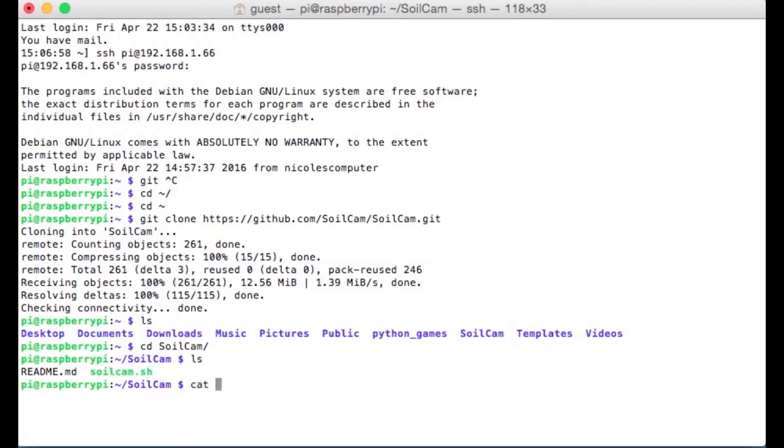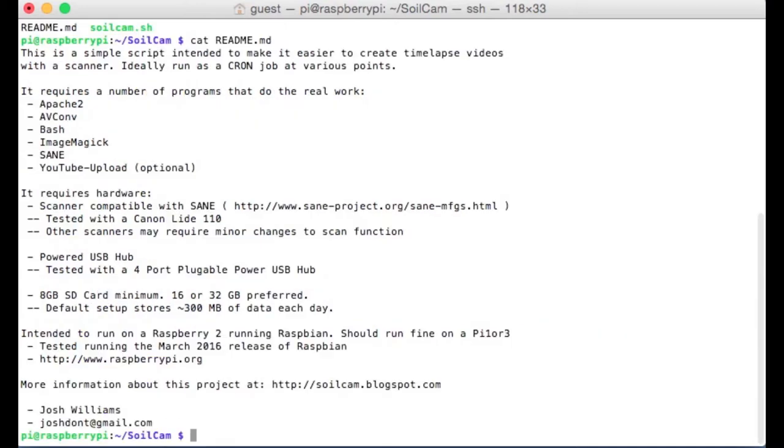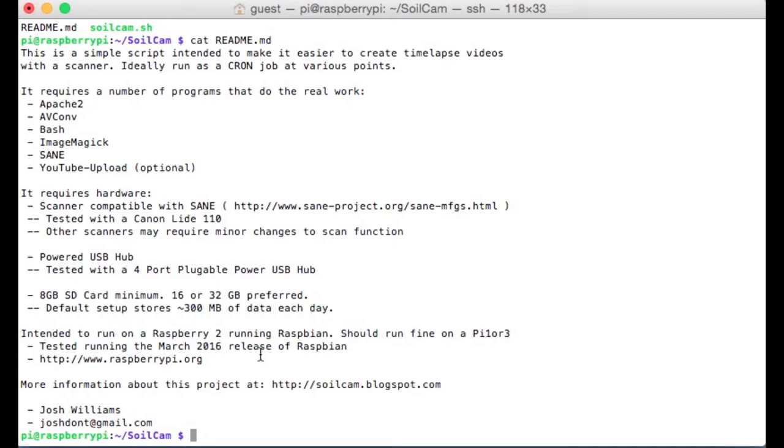If I use the program cat, I can type cat readme dot md, and that'll just display the text or the contents of that file into the current terminal. Nothing too important in here, doesn't hurt to read it. If I want to actually initiate a scan now, I think we're good to do that. Make sure your scanner is connected.